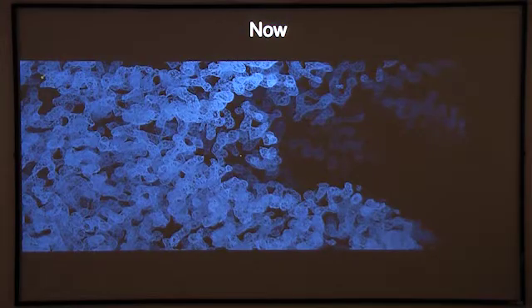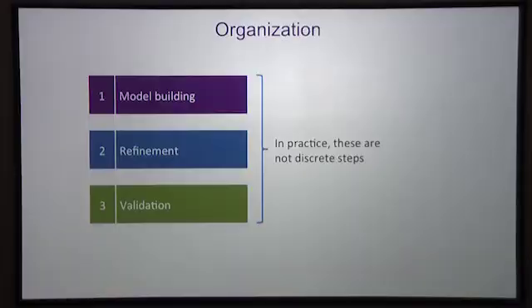However, nowadays, things aren't so straightforward. And simply pointing out the bits of your map that look like a phallic appendage, although it's still funny, is no longer suitable. At resolutions better than 4 angstroms, we're expected to provide an all-atom model. And interpreting a map with an all-atom model typically requires 3 steps: model building, refinement, and validation.